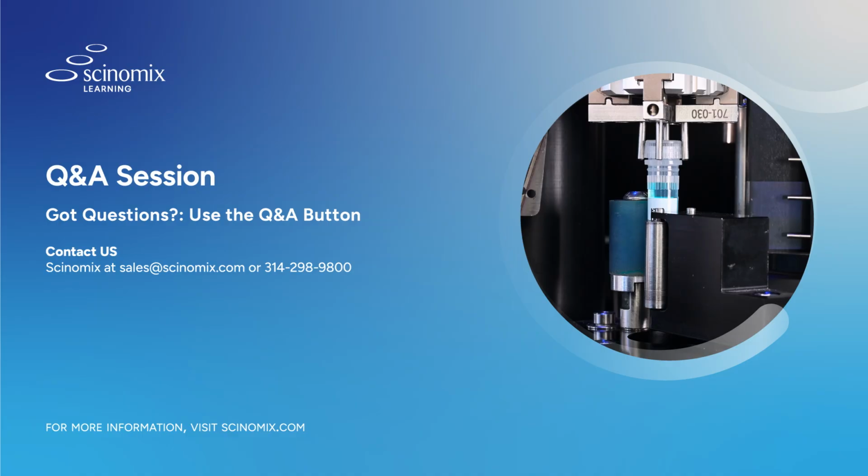Okay. So I have a question from Rui. I know I'm butchering that name. I apologize. Can this system execute serial dilution? Yes, absolutely. Using that work list, you're going to be able to input the exact fill volumes that you need, and then it's going to be dispensing different liquids into each well, right? Good. Okay. Same person. Next question.